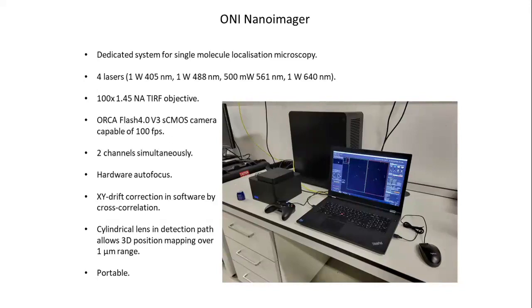Having more laser power helps you get more channels, to be quite honest, because there are some dyes that work really well, but when you want to do two, three different labels at once, it all becomes a bit more difficult, because the composition of that reducing buffer effectively needs to be optimized for different molecules. And you can partly get around that by just turning the lasers up. What do you get off it?